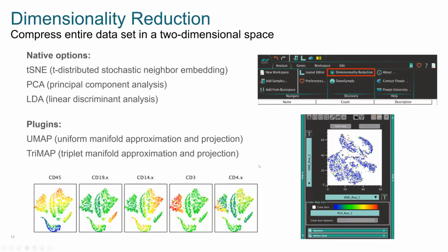So these are t-SNE plots, or t-distributed stochastic neighbor embedding. This is just going to be a low-dimensional representation of your high-dimensional data. As an example, you can see that these are the events from all of the events in an experiment, but similar events have been grouped together in these islands, right? So all of my events that have CD3 transcripts have all ended up in this island. The ones that have CD14, the ones that have more of it have ended up on this island, less of it maybe on this island, right? CD19, they've ended up in this island.